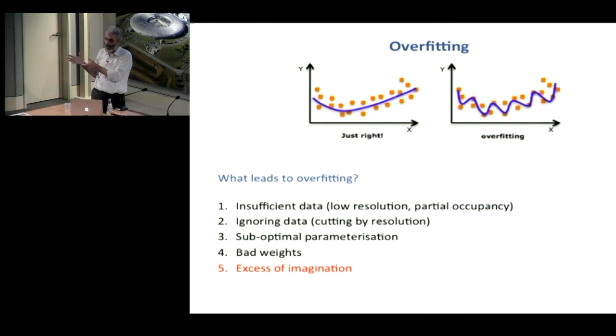And how can you increase the predictive power of the model? One of the tools in statistics is the use of so-called cross-validation. You divide the data into, say, 100 bits, and you refine against large portions, and then the small portions are considered as future observations. So you refine and then predict. You refine, predict, and calculate the prediction error. In cryo-EM, it's not easy to do.